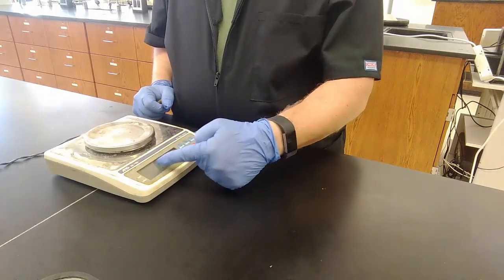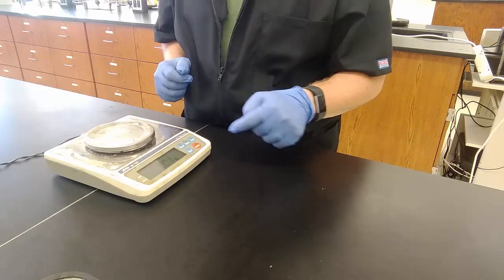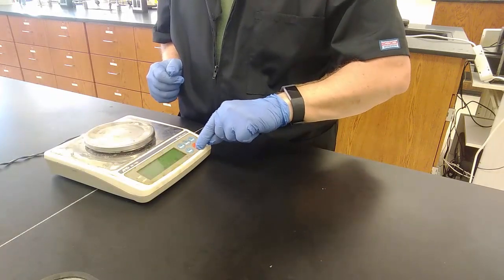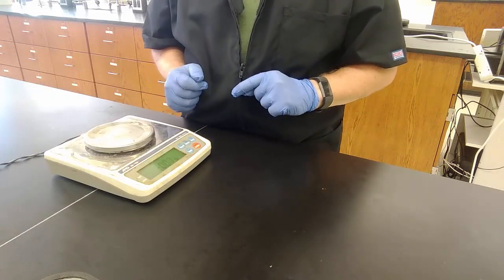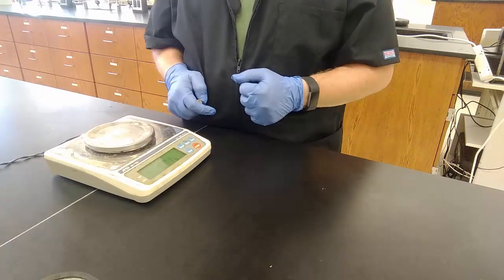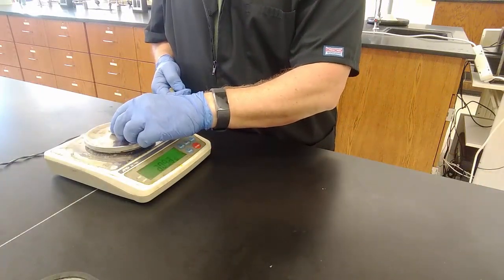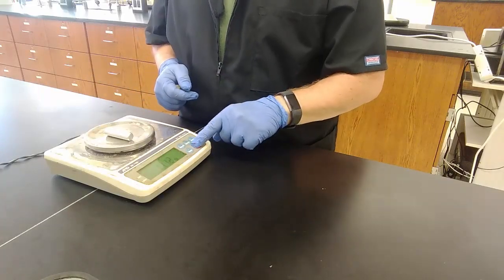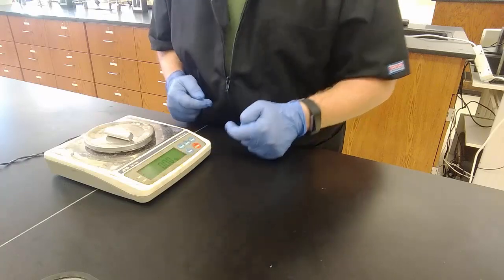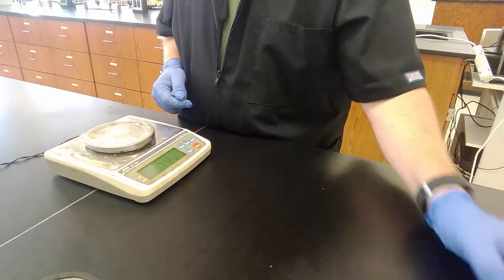So if my numbers weren't reading 0 here, which they pretty much are, it's a little bit windy in here with the fans on today, I would hit the 0 button, which is sometimes on certain balances called a tare button. Not T-E-A-R, but T-A-R-E. It sets the balance to 0. Even if there was something on it, I'll choose a different bar. Right? There was something on this. Let's say I had a flask or something. I could tare it, and so then the balance would read 0, whether you can read this number or not. And then if I took it off, of course, now it's reading a negative value.